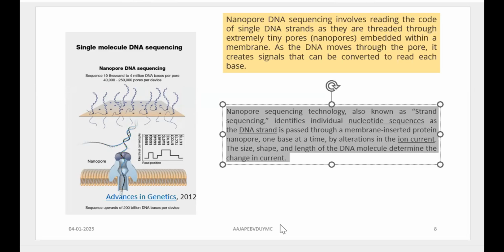So when it comes to the nanopore method, it is a single molecule detection method, a third generation sequencing methodology, you can say. And of course, it has a very broad scope in scientific research and in diagnostics, right? Now you can call it a cutting edge technology, or a high throughput method, where you are using biological nanoscale pores to detect nucleic acid molecules, right?